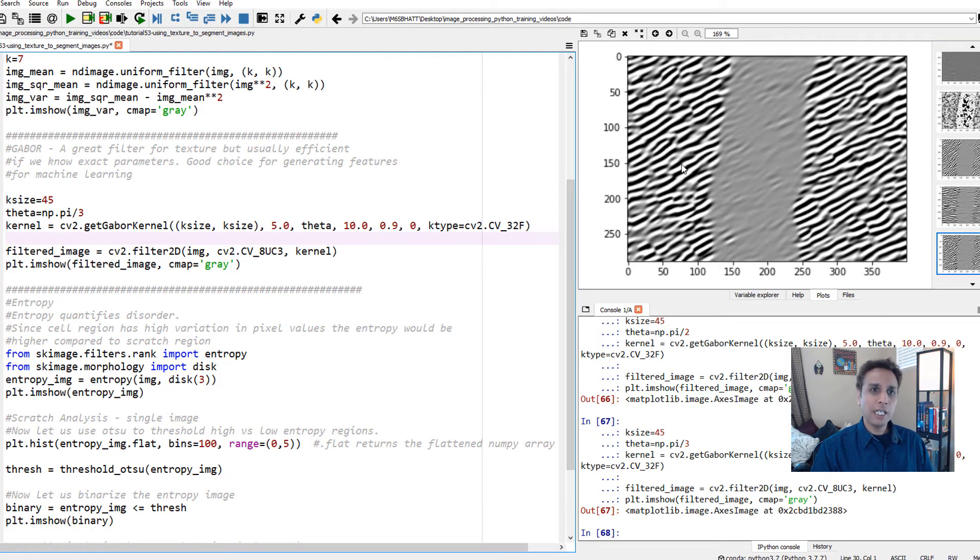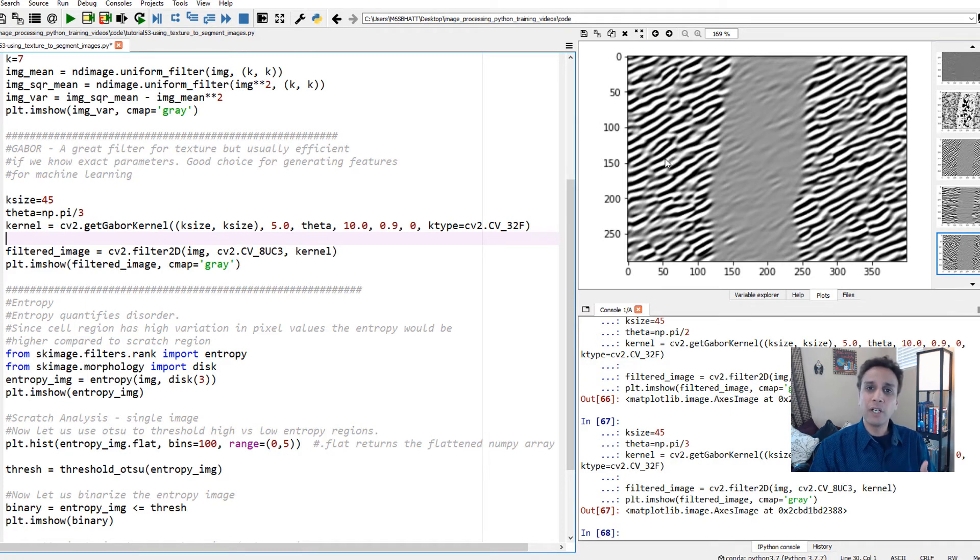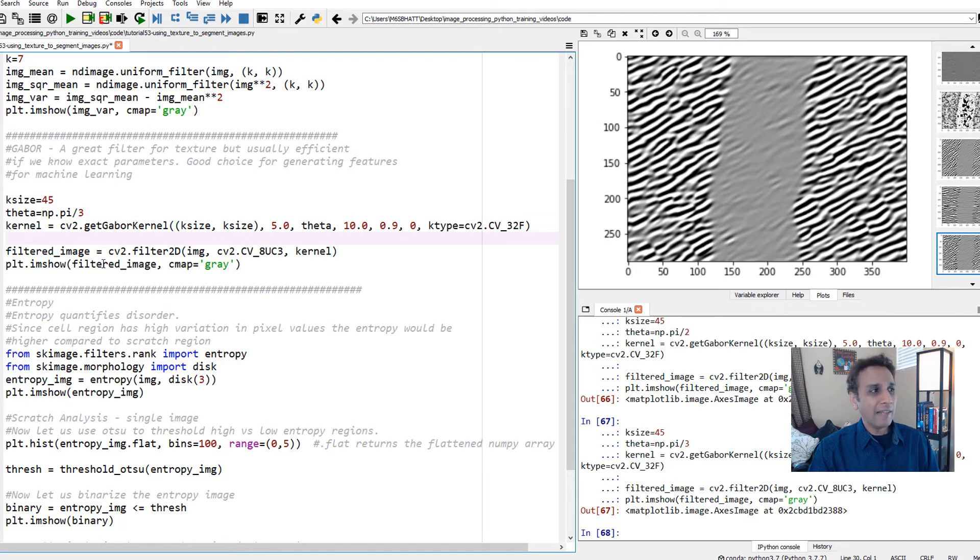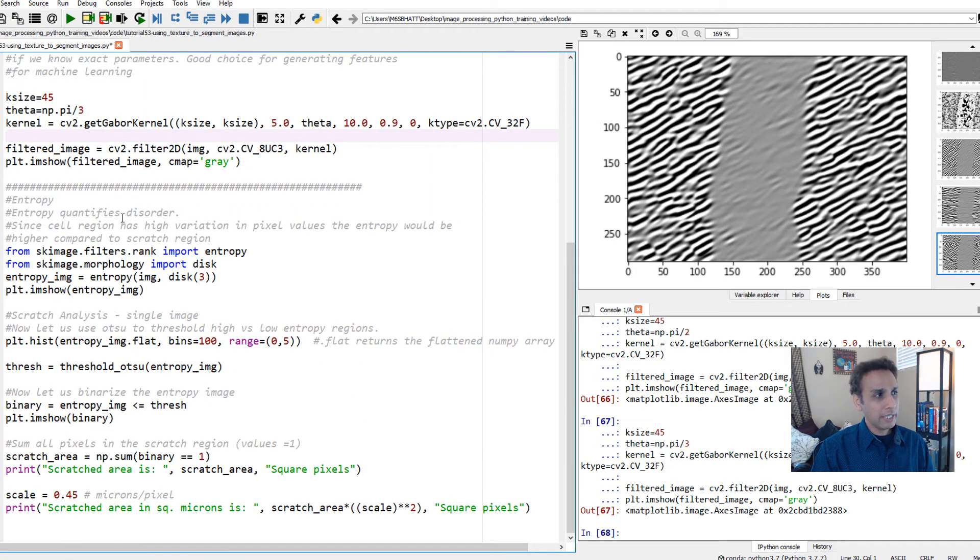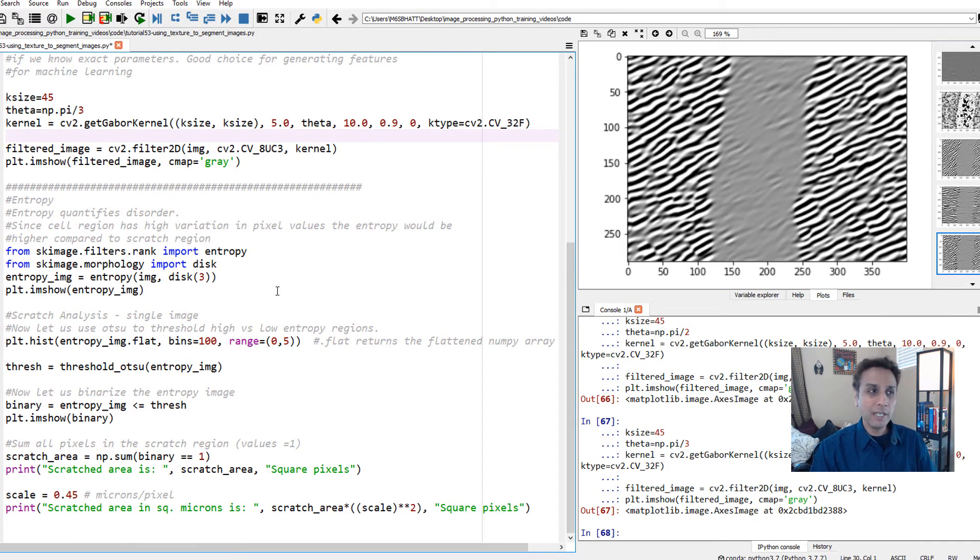This can also be used. In fact, this is not a bad output. This region is separated from this region, but I still need to quantify what this is. I need to figure out a way of separating this region from this. For that, Gabor is not useful. Let's get to the most useful part for segmentation - entropy.